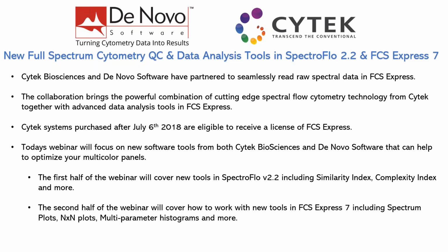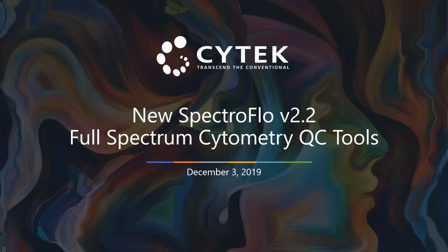So during the first half of the webinar, Janelle Shook is going to present new tools in SpectroFlo version 2.2, including similarity indexes, complexity indexes, and much more. Then during the second half of the webinar, I'm going to present some content about new tools in FCS Express 7, including spectrum plots, N-by-N plots, multi-parameter histograms, and a lot of the other new functionality that's available within FCS Express 7. So with that, I'd like to introduce Janelle Shook. We're going to make her the presenter here, and she's going to take over for the first portion of the webinar to tell us a little bit about some of the new tools in SpectroFlo.